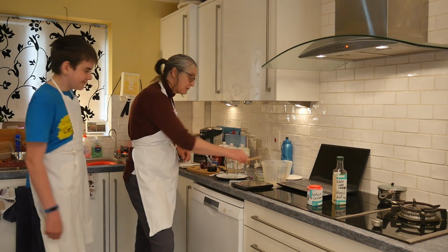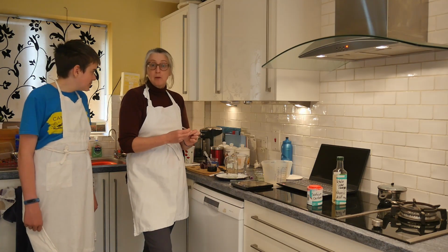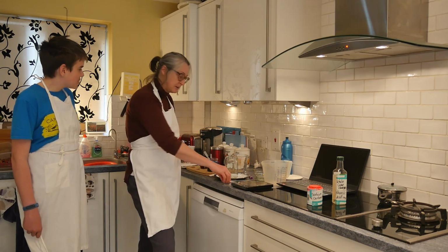Now, that's in case you need to stir it. Hopefully you won't need to stir it, because we're going to use swishing to stir. That's the standard way of stirring when you're doing titrations: to swish. Like this.